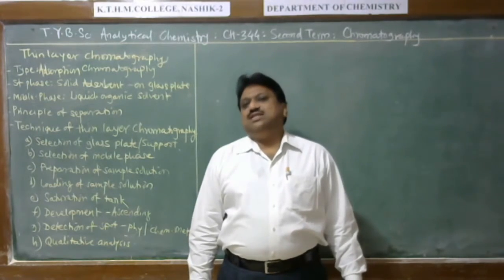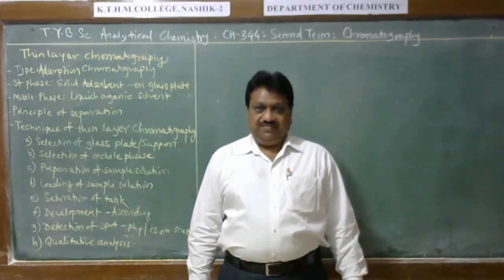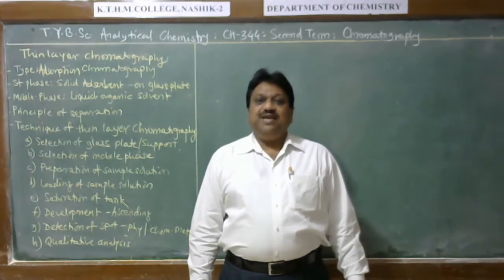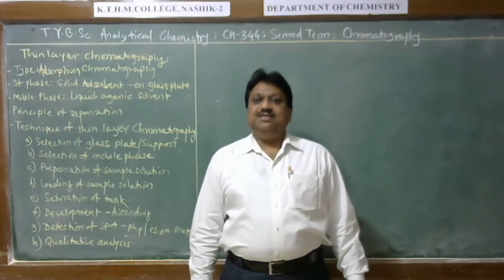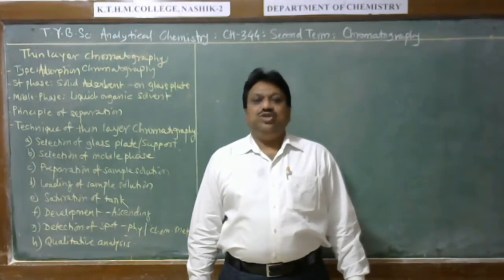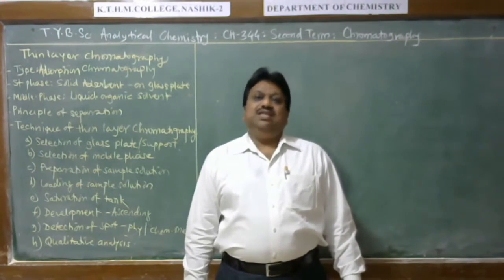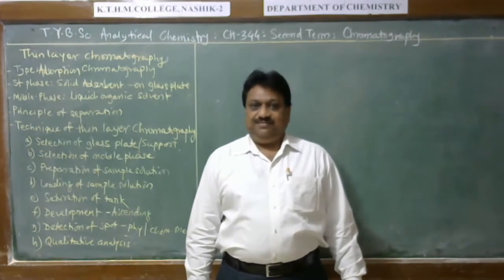The mobile phase dissolves the sample components and carries them through the stationary phase. When these sample components come in contact with the stationary phase having specific functional groups, a bond is formed, that means a hydrogen type of bond is formed between the solute molecule and the adsorbent material. And the stationary phase tries to hold this molecule on its surface by forming such a bond.